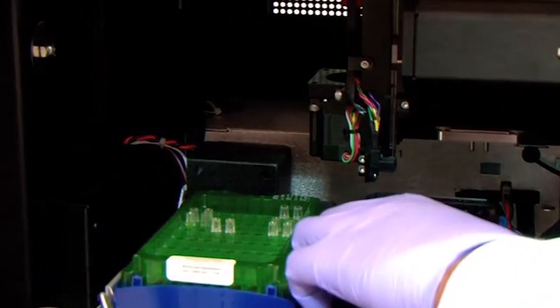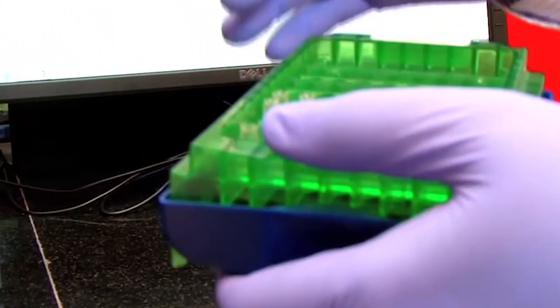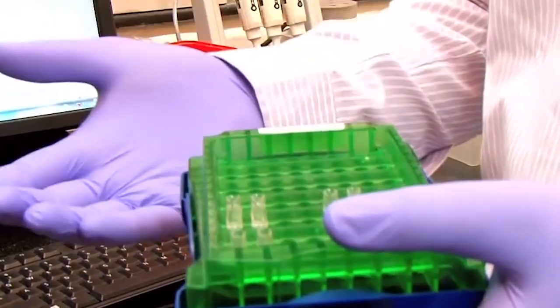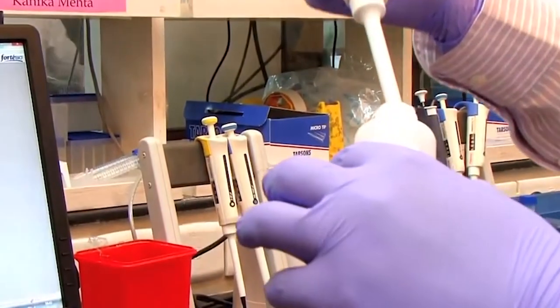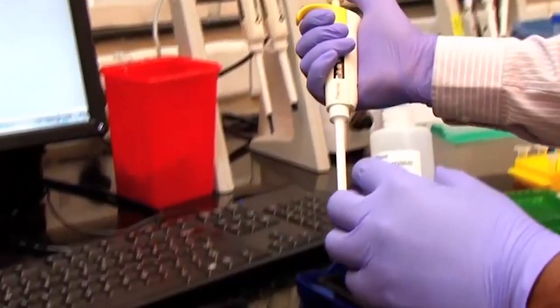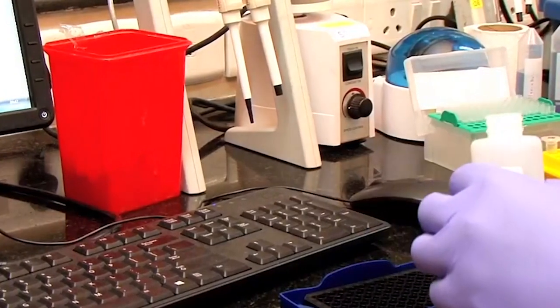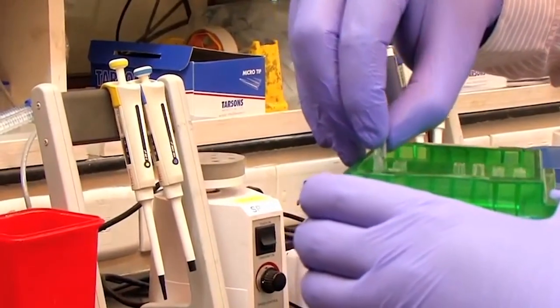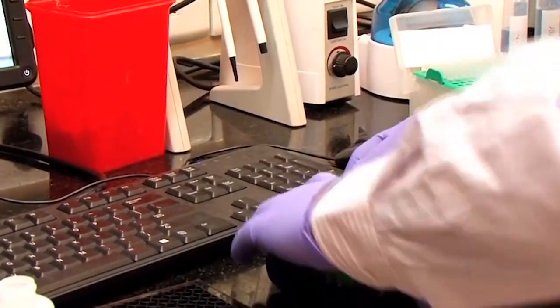Now I'm going to take back this sample plate and also the sensor tray. This sensor is hydrated in the PBS buffer, and our biotinylated antibody is also in the PBS buffer. Now I'm going to equilibrate these sensors with the PBST buffer, the PBS buffer having Tween in it. We call it the sample diluent buffer. Here I'm going to take 200 microliters of this PBST buffer and add it in A2 and B2. Now I'm changing the sensor position from A1 B1 to A2 B2. So now I will start the equilibration of the sensor with this particular buffer.